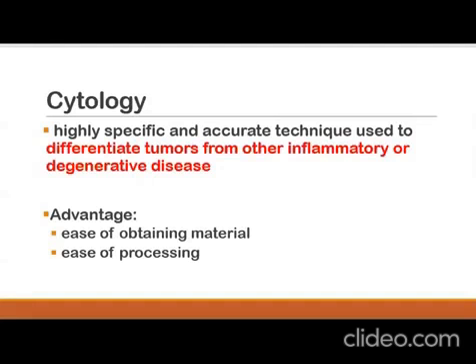So the advantages of the techniques used under cytology, such as your Pap staining method, is of course, first, the easiness. The easiness of obtaining the material, the easiness of obtaining the specimen, to be exact. Okay? And actually, this easiness that I am talking about actually led to a significant reduction of the incidence of cervical cancer. Kasi since madali lang mag-collect ng specimen, madali lang ma-perform yung test, so madali lang ma-diagnose yung mga babaeng may cervical cancer.